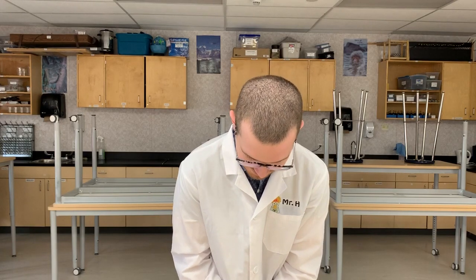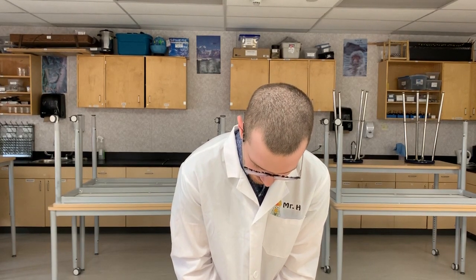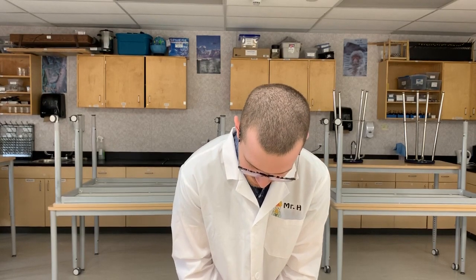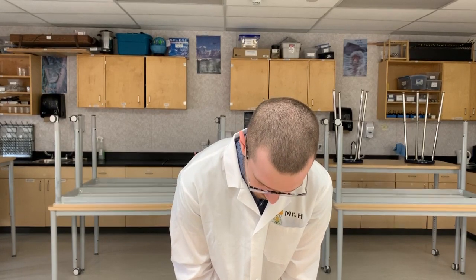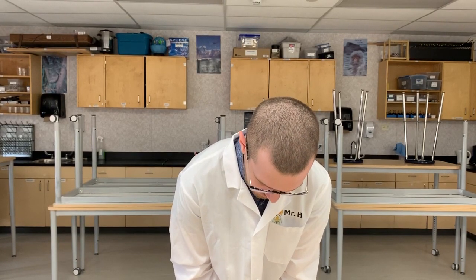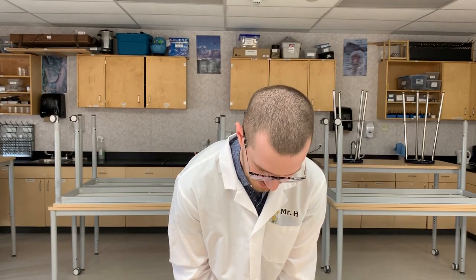When I scratch it with this coin, it's not easy to scratch, but it's not hard either. So it's going to be somewhere around the middle of our scale, likely a 5 or a 6. Obviously it's going to be different for each sample of a mineral, but this one in particular is about a 5 or a 6.